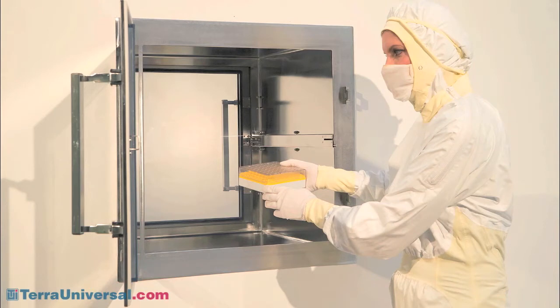Terra Universal's Clean Scene Plus pass-through provides a convenient non-contaminating transfer chamber that lets you move materials in and out of a clean room without contaminating the classified clean space.